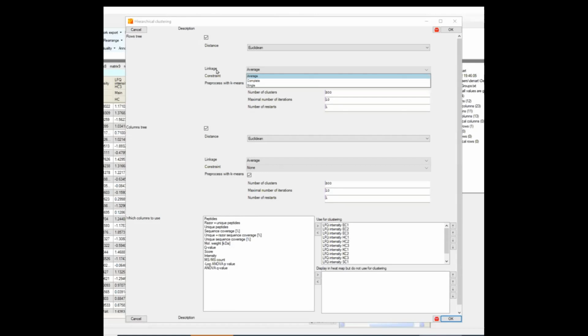So it creates a distance matrix, and then from this distance matrix you start merging together the closest points in this space. So you are creating clusters from individual proteins. You take the two proteins that are closer and merge them into a cluster. Then you do the same again, and when you have only clusters, you calculate the distance between clusters and merge the closest ones. And how are you calculating the distance between two clusters? Using the linkage hyperparameter, right?